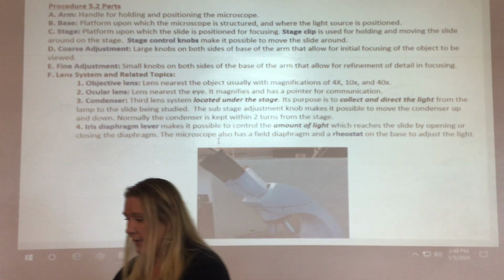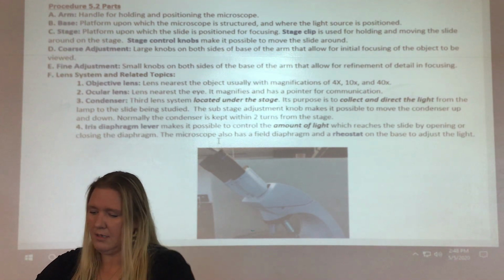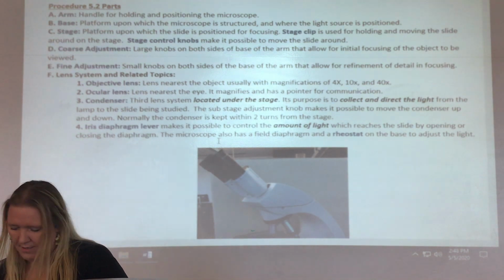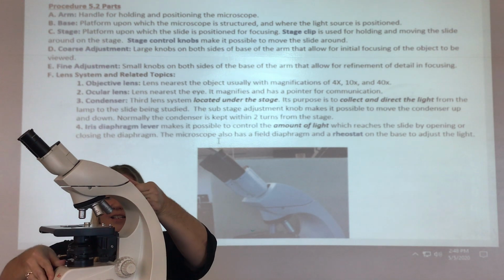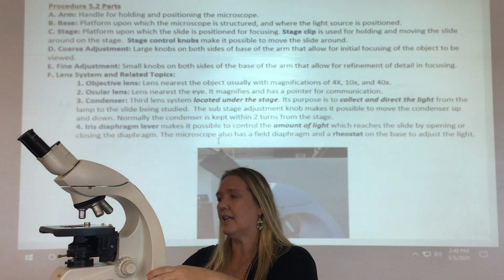All right. So let me set this table up real fast so we can get the microscope in the screen. Table's heavier than the microscope. Make sure we're in view. Give us just a second to make sure.